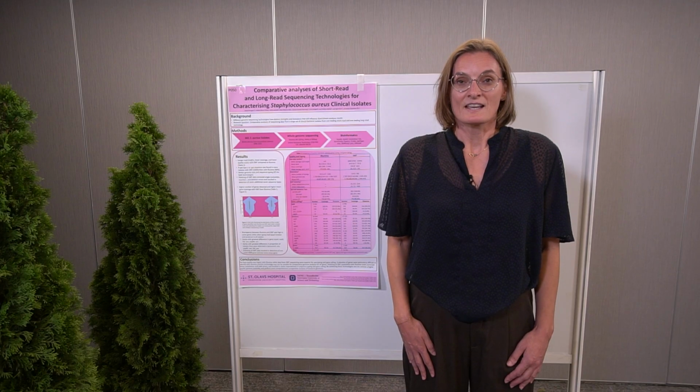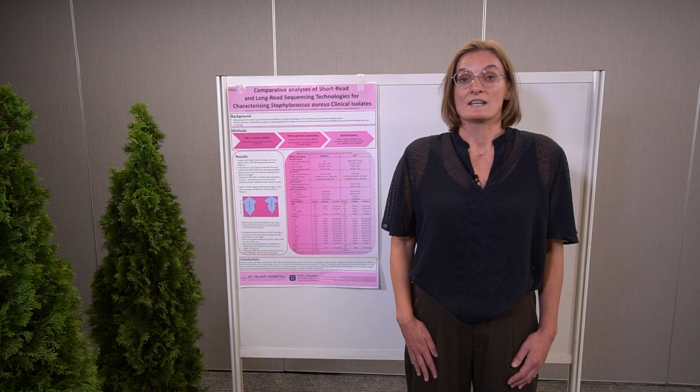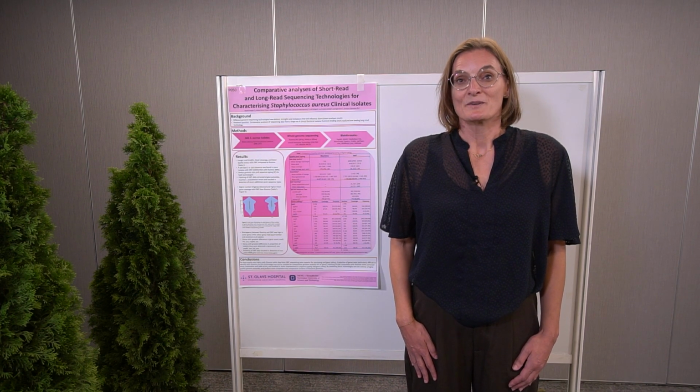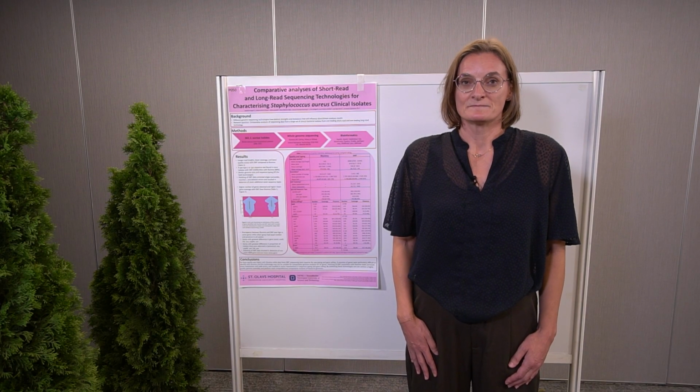results. So to do that, we performed whole genome sequencing using Oxford Nanopore technology. And we also polished the Oxford Nanopore assemblies using Illumina data. So the results from that comparison is what's presented in this poster.